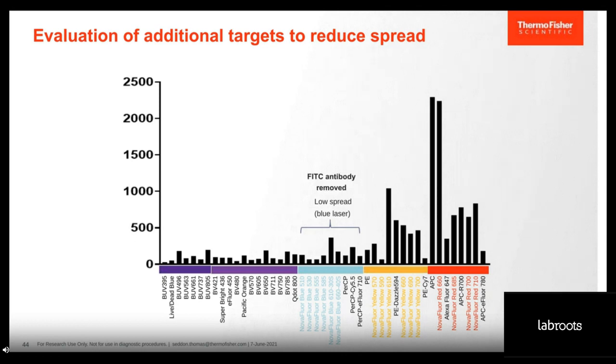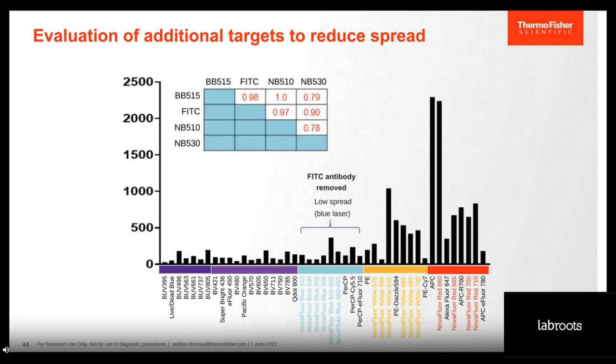One thing I want to draw your attention to is that part of this happened because, when you're building out a 45 color panel, it turned out we had ordered an antibody and it hadn't arrived in time to do the experiment. So I had to leave that out. But this ended up being fortunate because you really didn't have some of the issues that you might have otherwise.